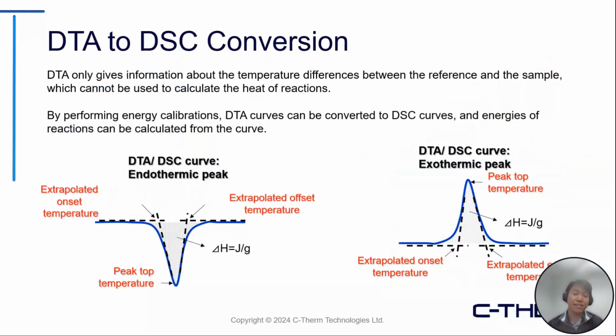So I've described earlier that the DTA curve is essentially a mechanism to track the sample's temperature as the measurement goes on. And any endothermic or exothermic reaction would be perceived as a peak in the DTA curve. But since DTA is more of a qualitative measurement of whether the sample undergoes such reactions, we cannot quantify the degree of energy released during that reaction.